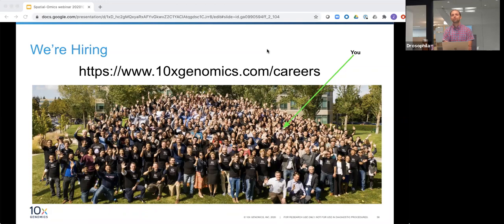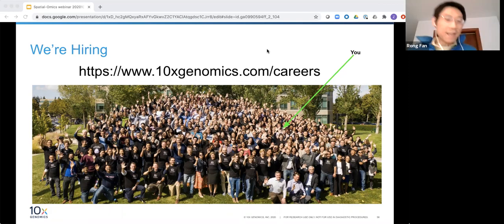And it'd be great if we could, as a community, land on a single place that all spatial analyses could start from. That would be great. Yeah, that's a great point, actually, Ahmet. I think it's hard to change the clinical pathology practice, but maybe we should get it started. And if we can tell people the best practice to do your FFPE, your formalin fixation, that might be good for the future of the field.